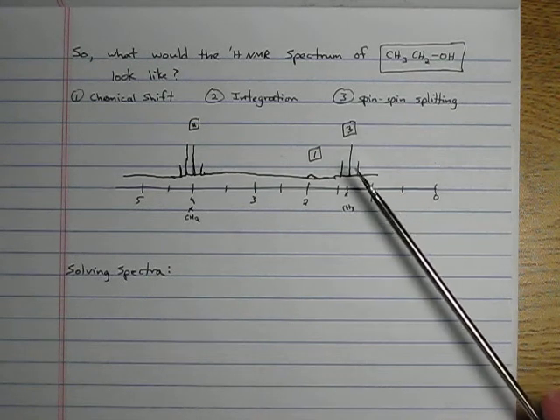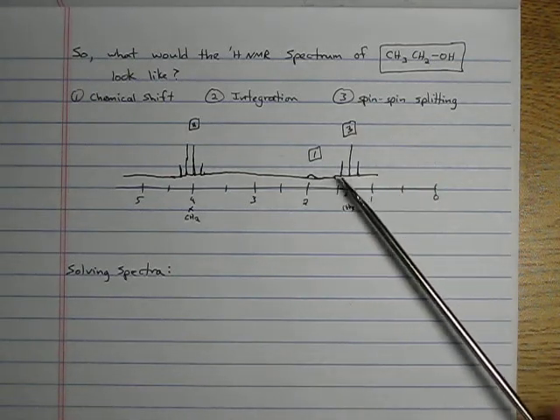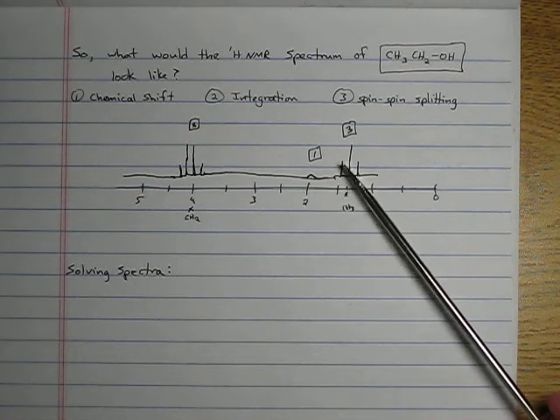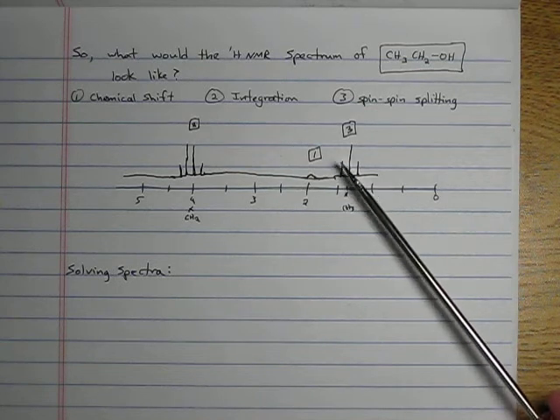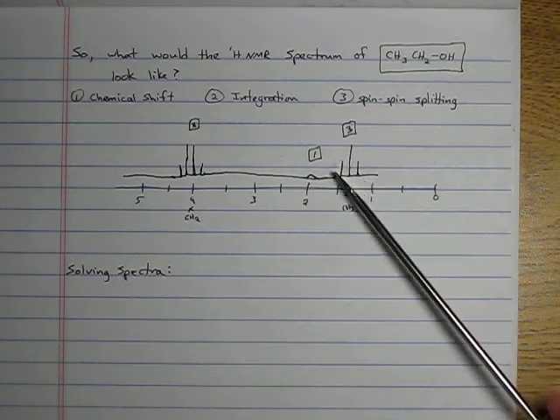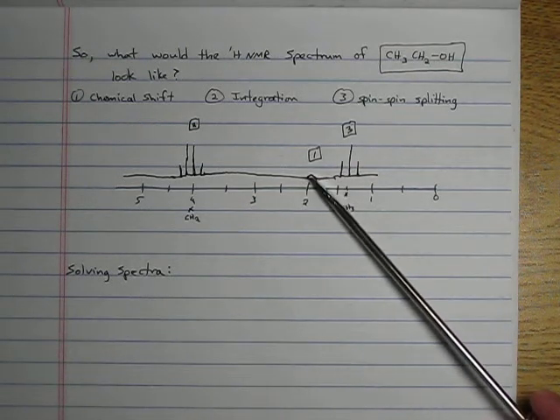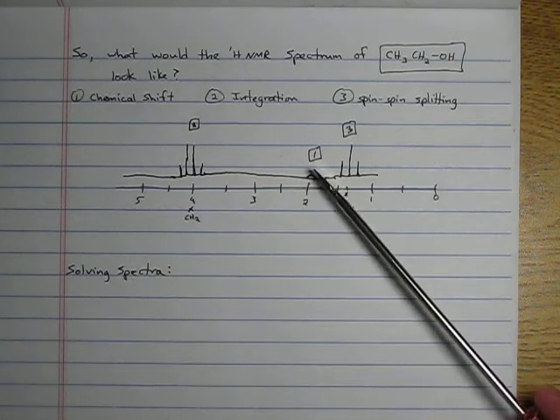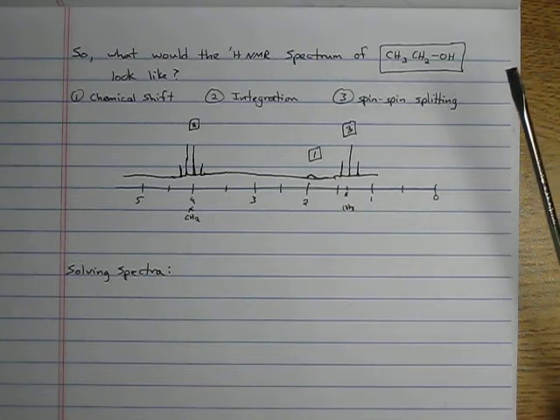Note, since we're looking at area under the peak, the sharper the peaks are, the less width you have in your individual peak, which means the smaller the area is, which means the peak has to be tall. These are sharp peaks, so they have to be fairly tall to get an area of 3 when you combine them together. If it's a broad peak, well, that's a lot of area. Look at what we can see there. So this OH peak is not only going to be broad, but it's going to be really short because we've got a whole lot of area under broad peaks.